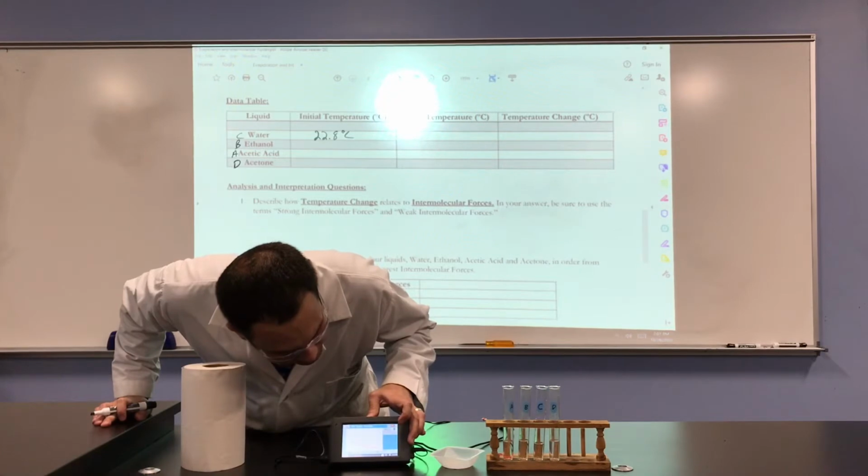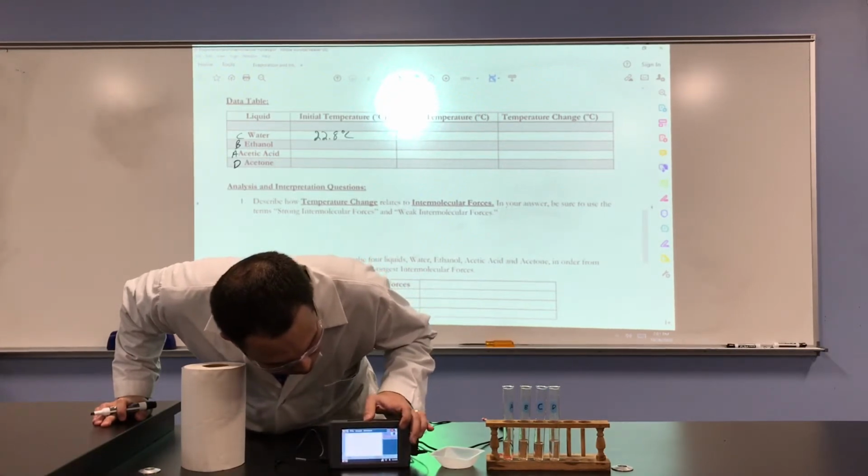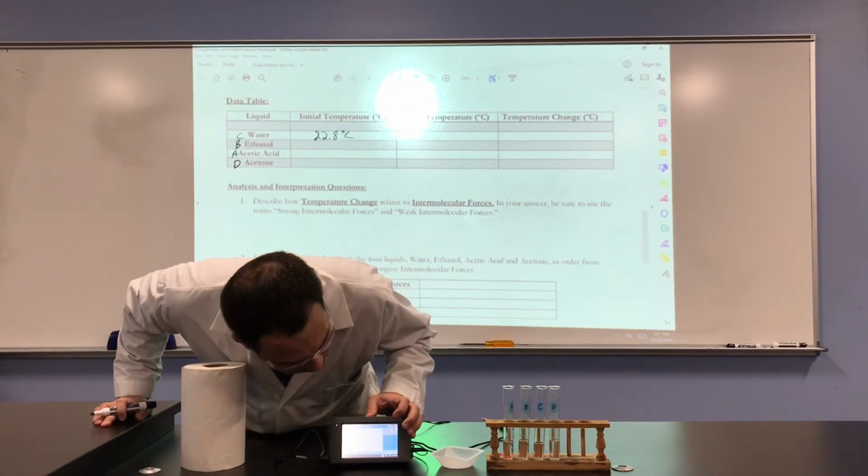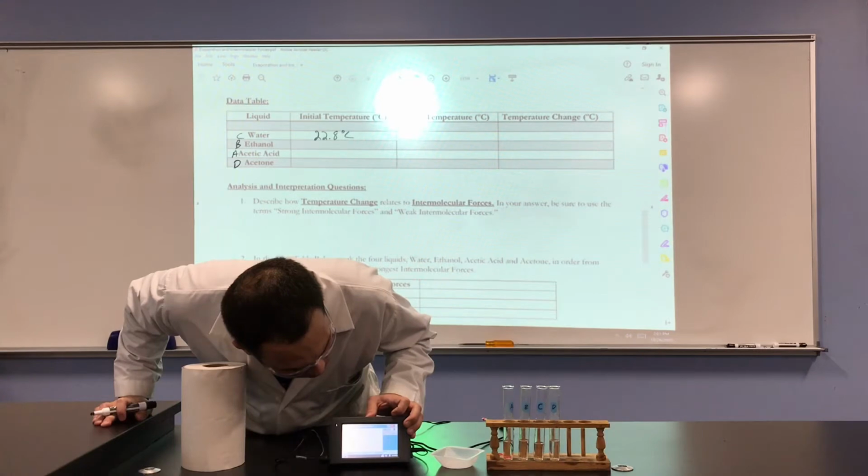We're at 160 seconds, so 20 more seconds. We're at 18.7. 170 seconds. We're still at 18.7.